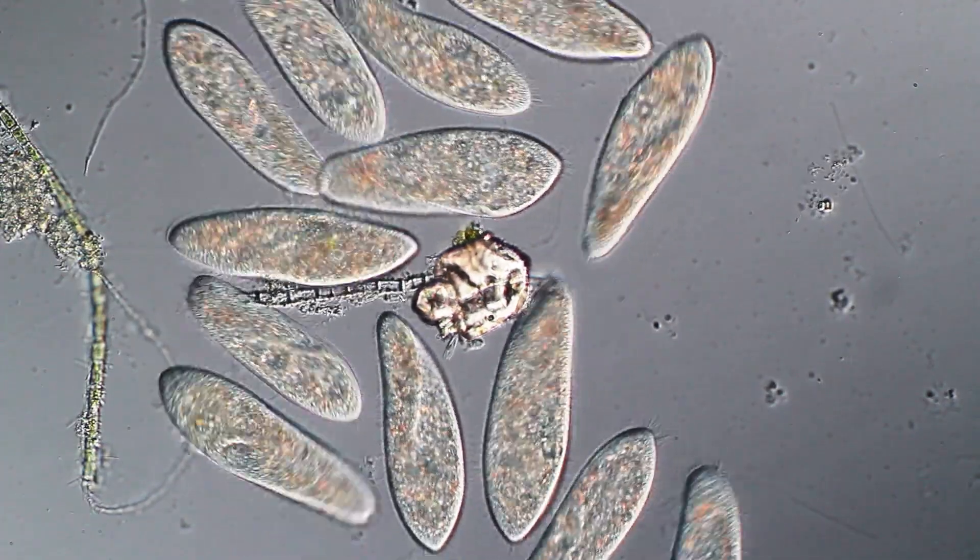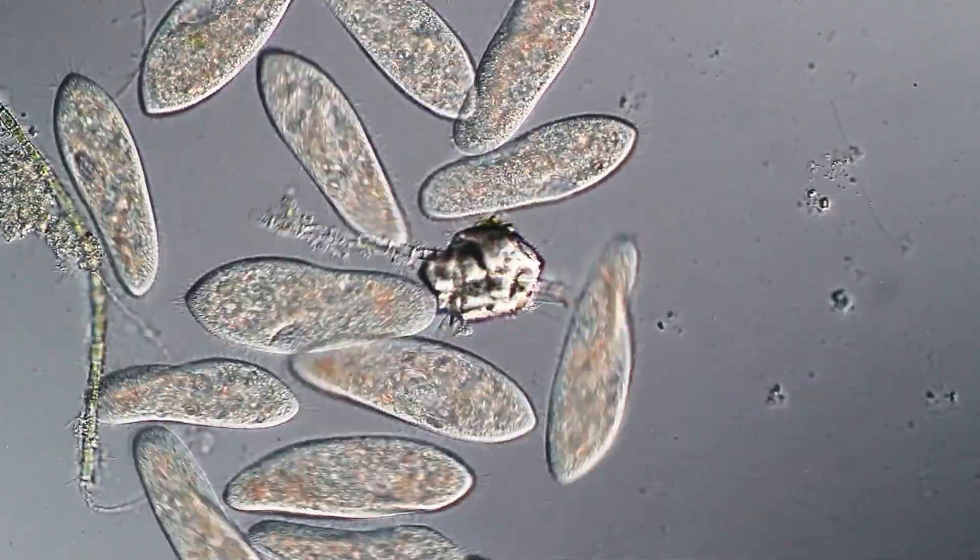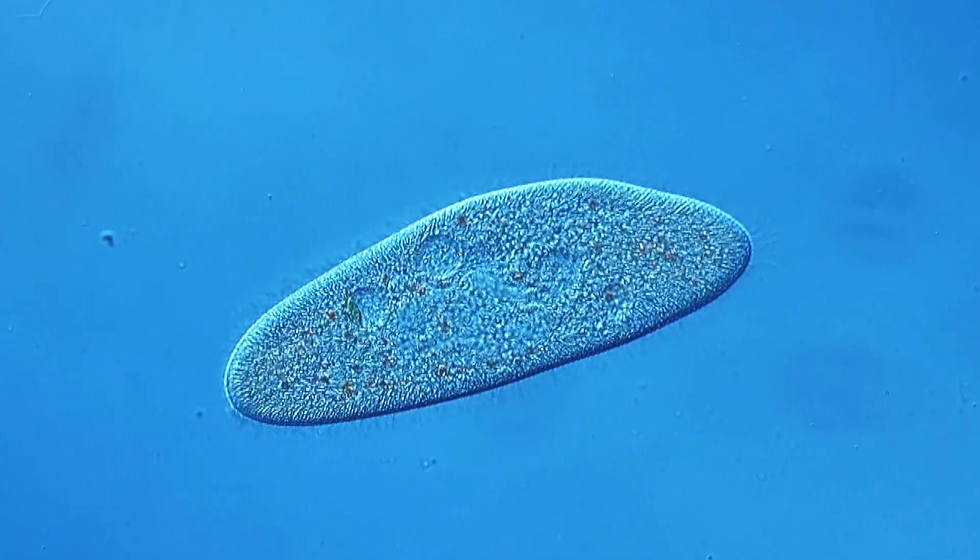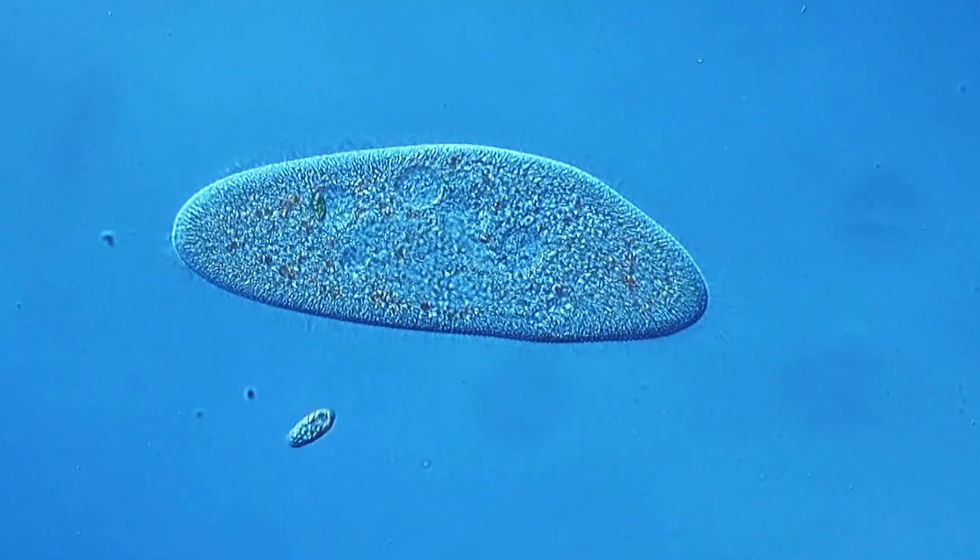And for this reason you probably want to slow them down somehow and I'm going to explain to you now two methods on how you could do that. By slowing them down you can of course also zoom in much more. You can use a higher magnification and therefore you can also see the details of the cell that you're looking at much better and there are a variety of other advantages here.